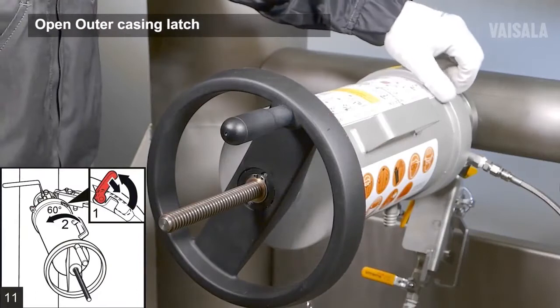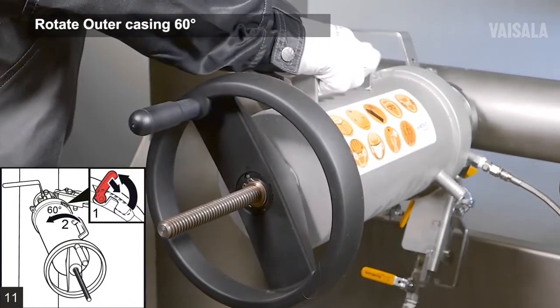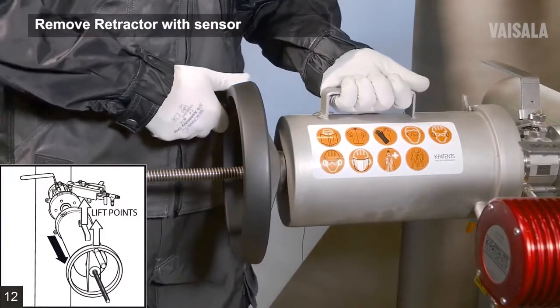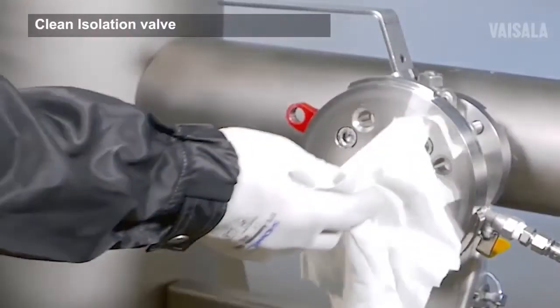Lift open the outer casing locking latch. Rotate the outer casing 60 degrees counterclockwise so that the handle comes up on top. Take a firm hold on the hand wheel and the handle and pull out the retractor with sensor inside.